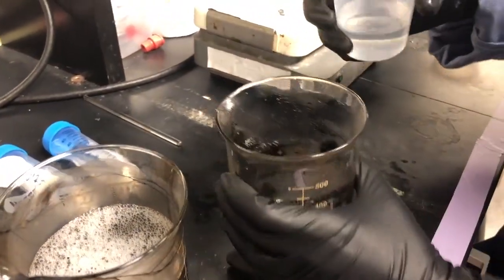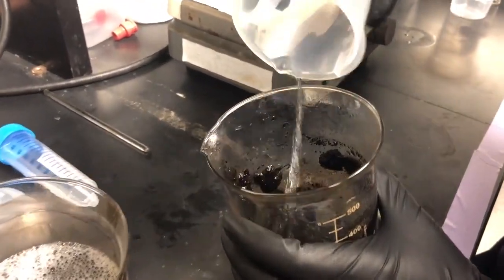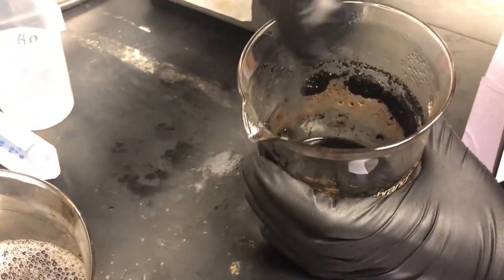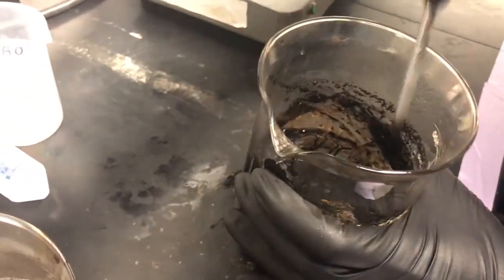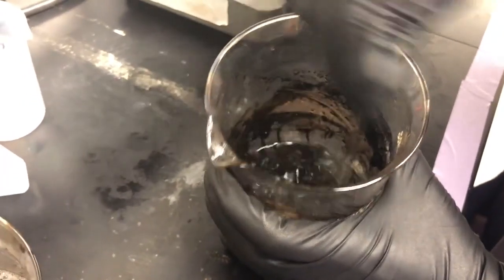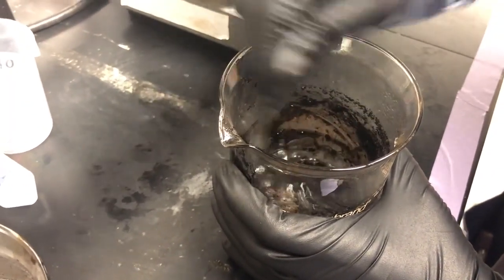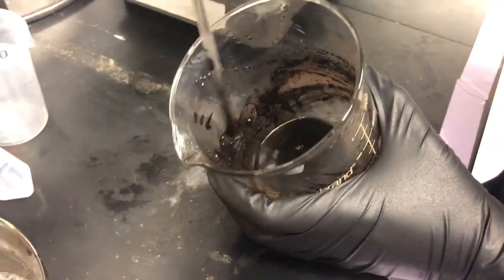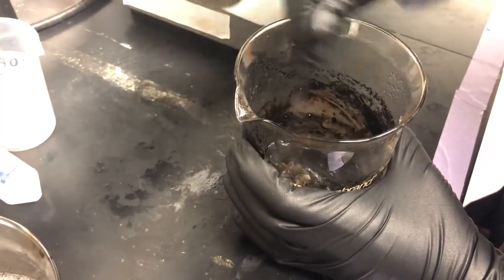So this is first our larger 50 ml wash, and we're going to use our stir bar to help us mix out these clumps and dissolve these clumps into the ethanol. This is going to try to remove the excess water, but it's also removing any unreacted oleic acid. So this is our polar / non-polar removal. You want to try to break up all those clumps, but don't spend any more than maybe 30 seconds to a minute, because anything more than that really is just not necessary.